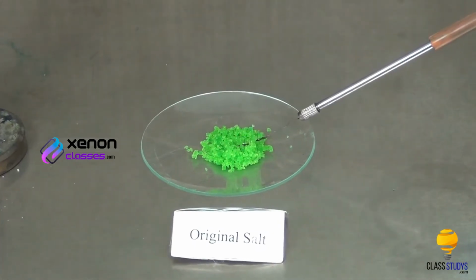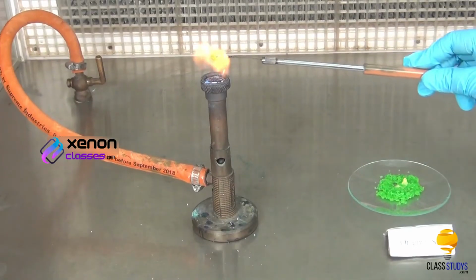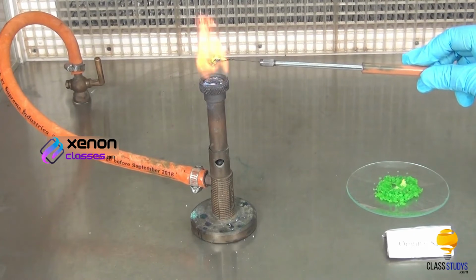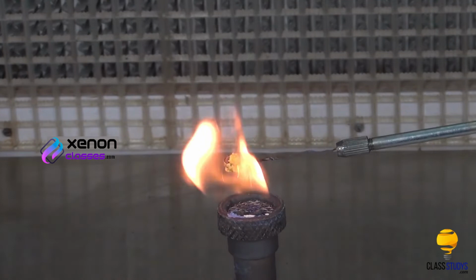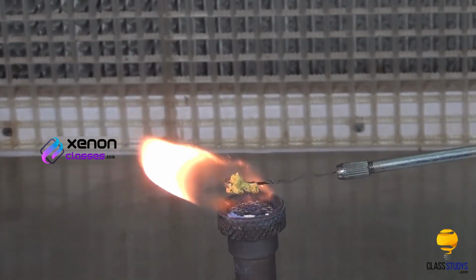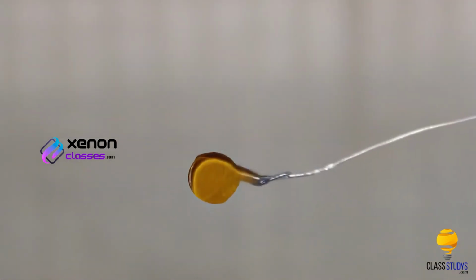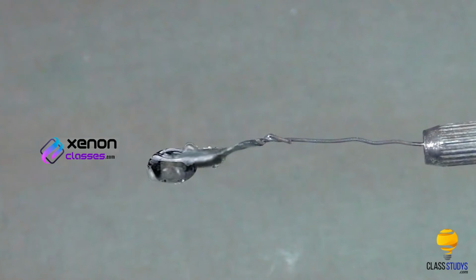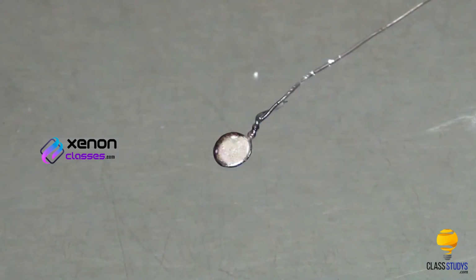Dip the hot bead in the watch glass containing salt. Heat it again either in the oxidizing flame or in the reducing flame of the Bunsen burner. In the oxidizing flame, the color of the bead becomes brown when hot and pale brown when cold. In reducing flame, the bead becomes grey when hot and opaque when cold.